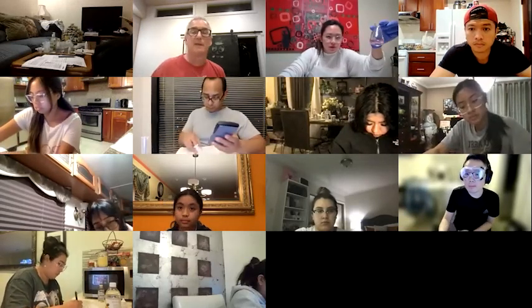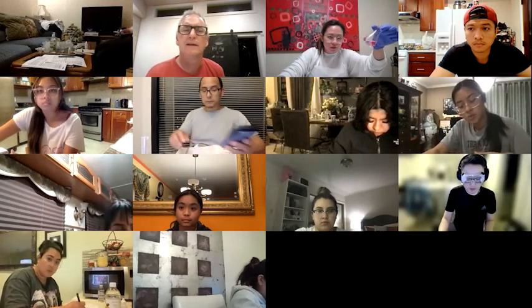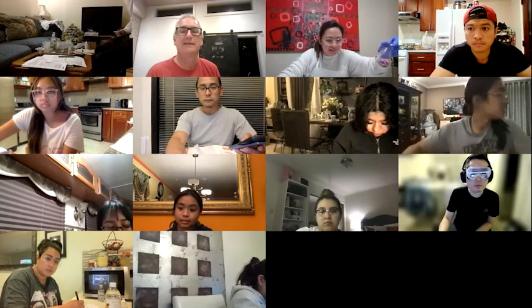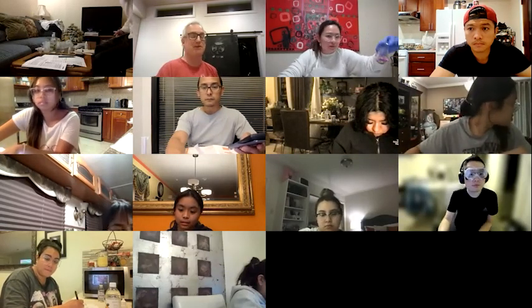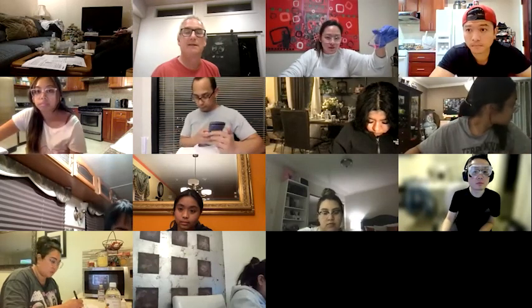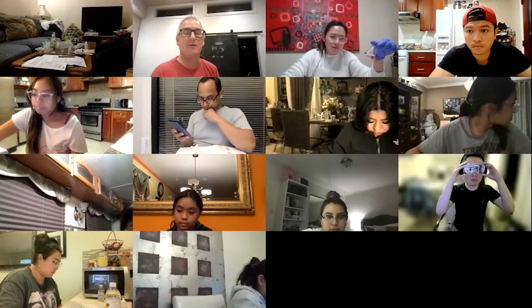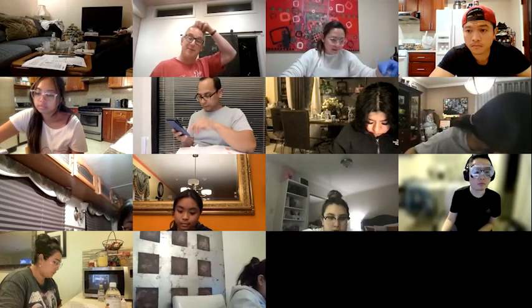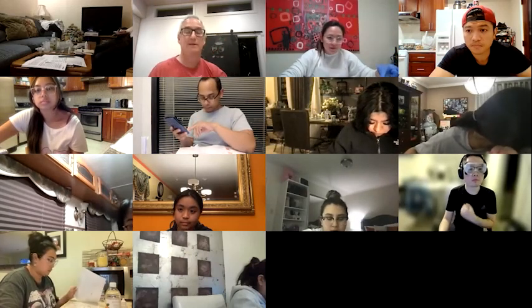Professor, I think this is a good color, right? Oh, that's perfect. That's really nice. My third try. Excellent. Use that for your picture, because it's just not going to get much better than that. So just one picture for each? Yeah, I would definitely use that one, because that one's perfect. I would say you got your quarter drop on that one.